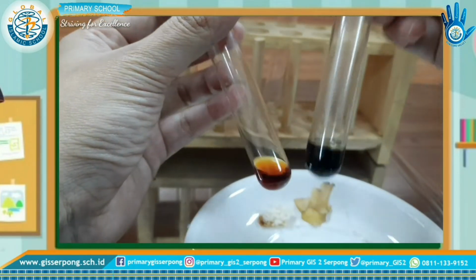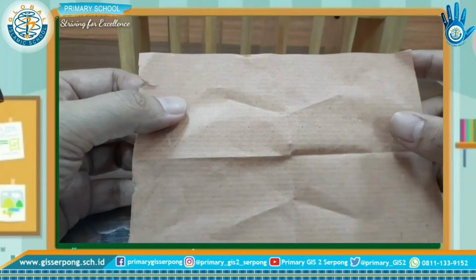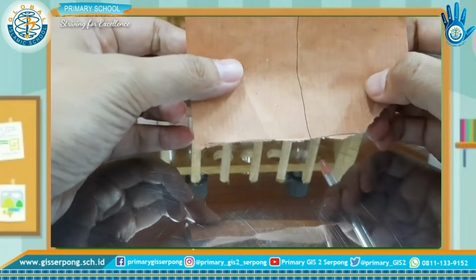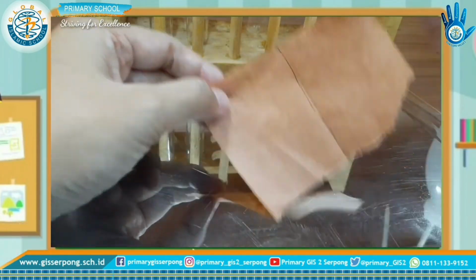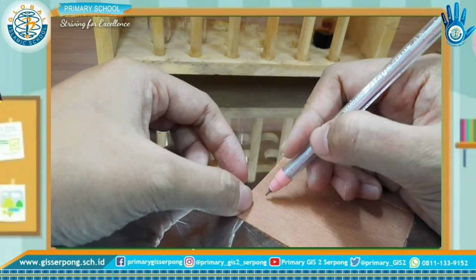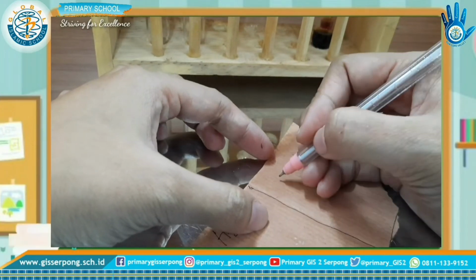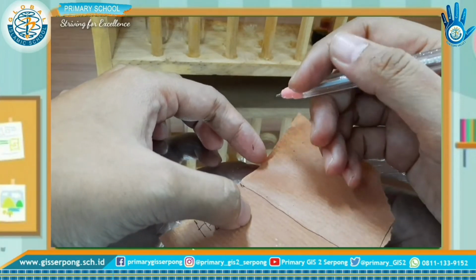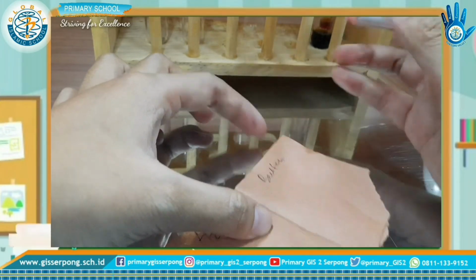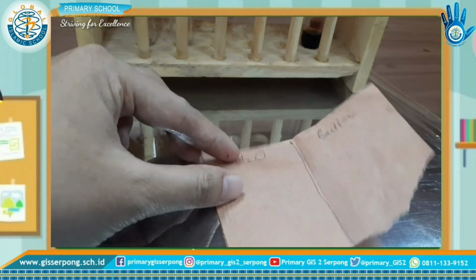Let's move to a lipid test or fat test. Okay, for fat test or lipid test, take the brown paper and then split the paper into two parts and make control without sample and with sample. For the control, you can use water, and then for the sample you can choose one, butter or yellow egg. I use butter, and let's check it. Just apply the sample.